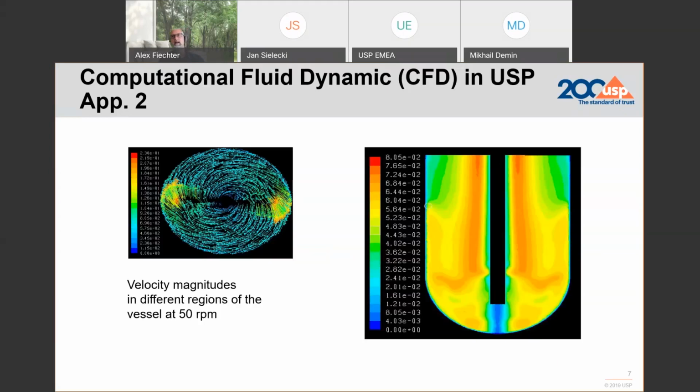To your right-hand side, you see the vessel with the shaft assembly, with a paddle here in the same sense. You don't see the paddle left and right, it is in rotation. But what you can see here is the more orange or the more red it is, you see more turbulences, more energy, more agitation than anywhere else.